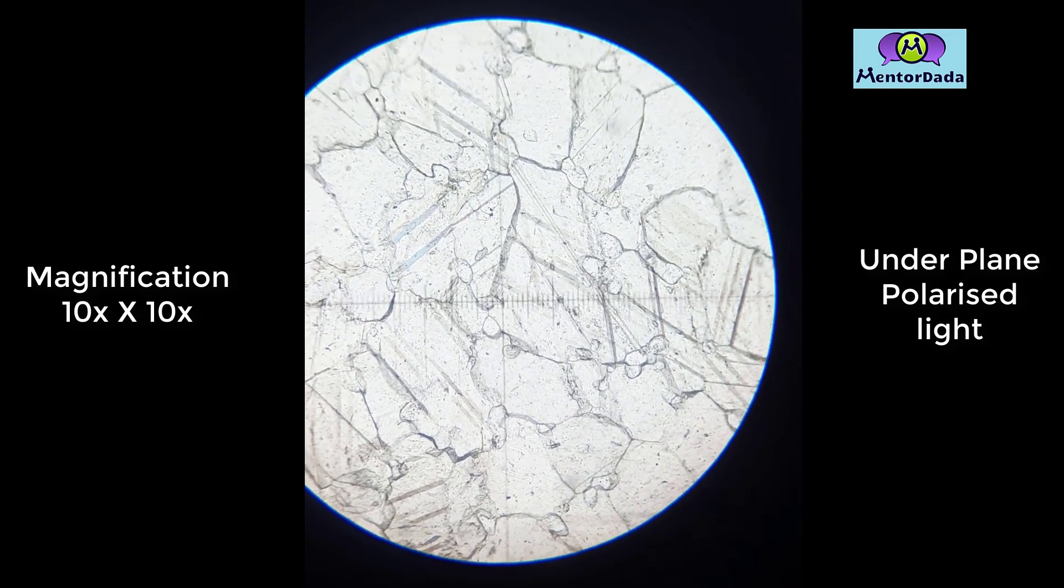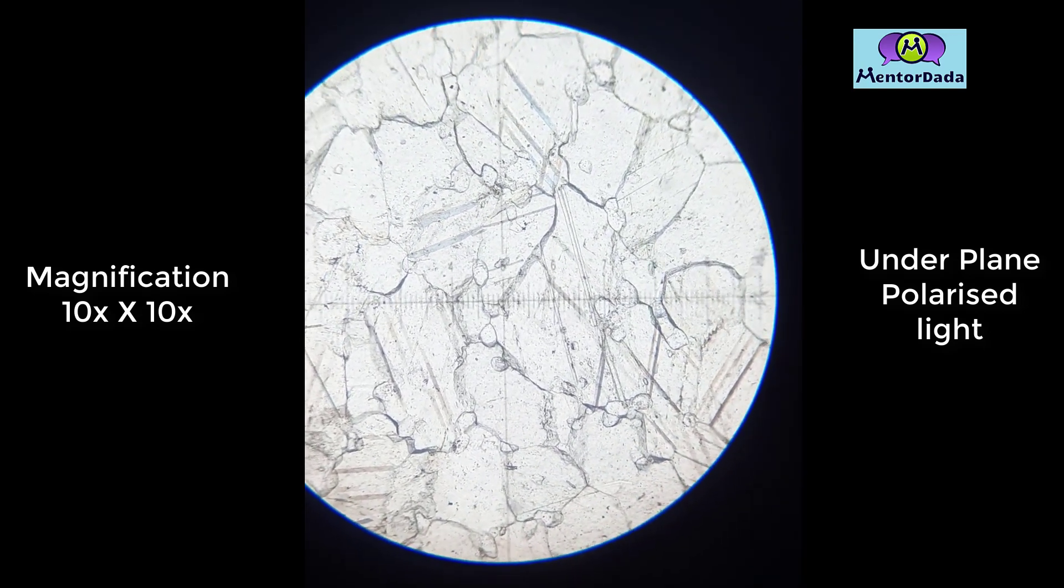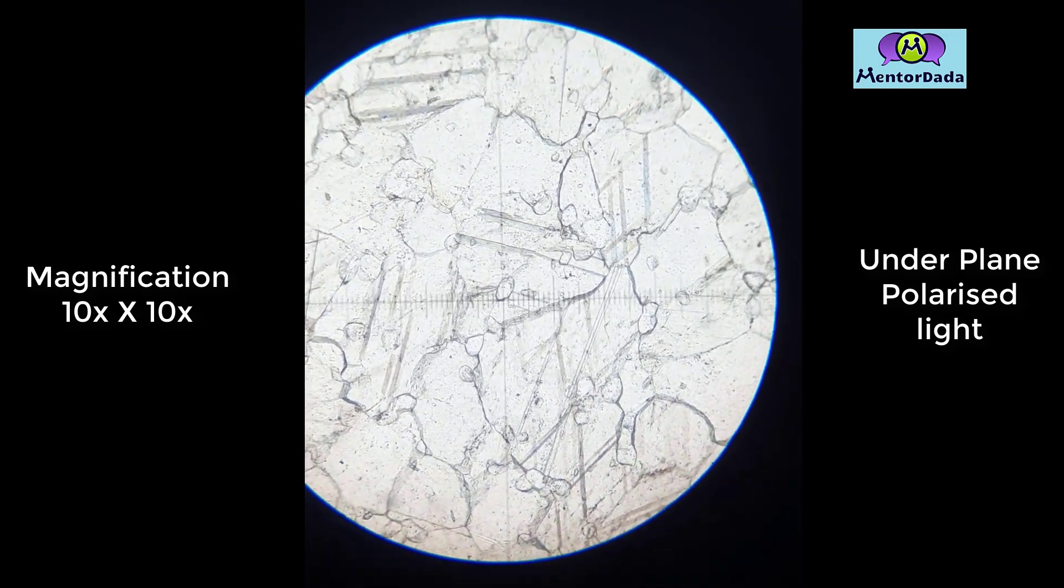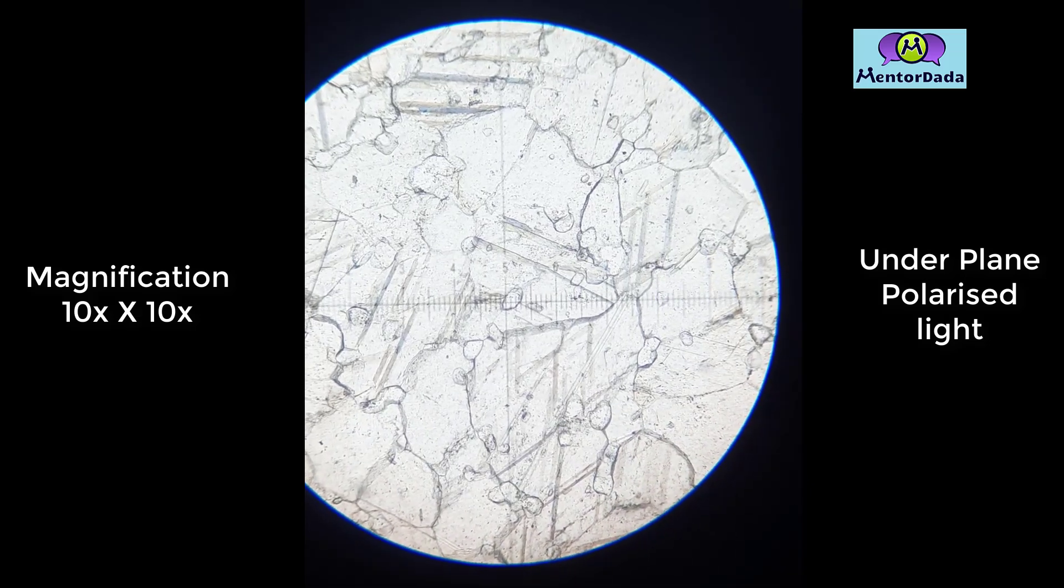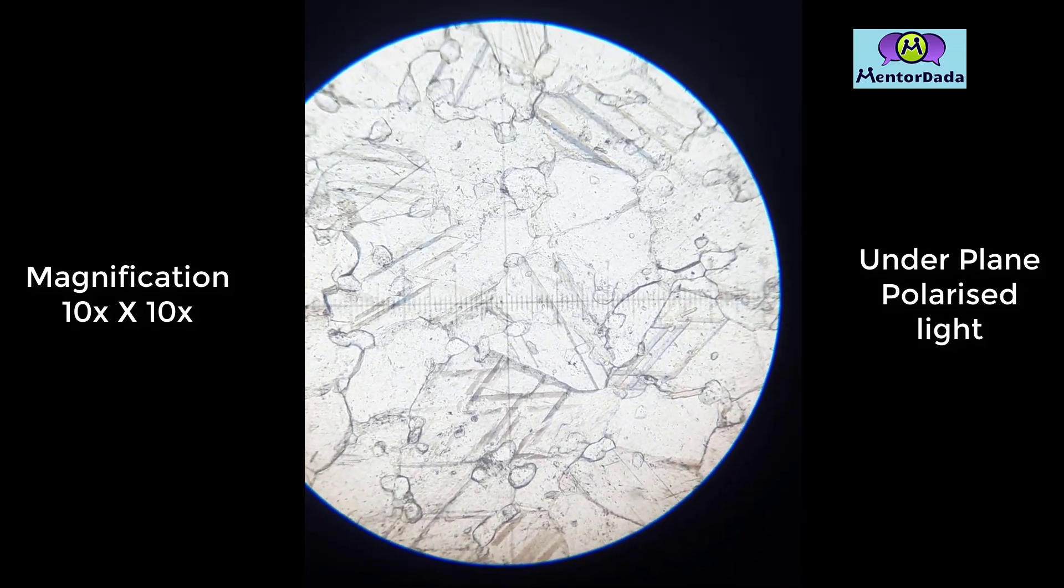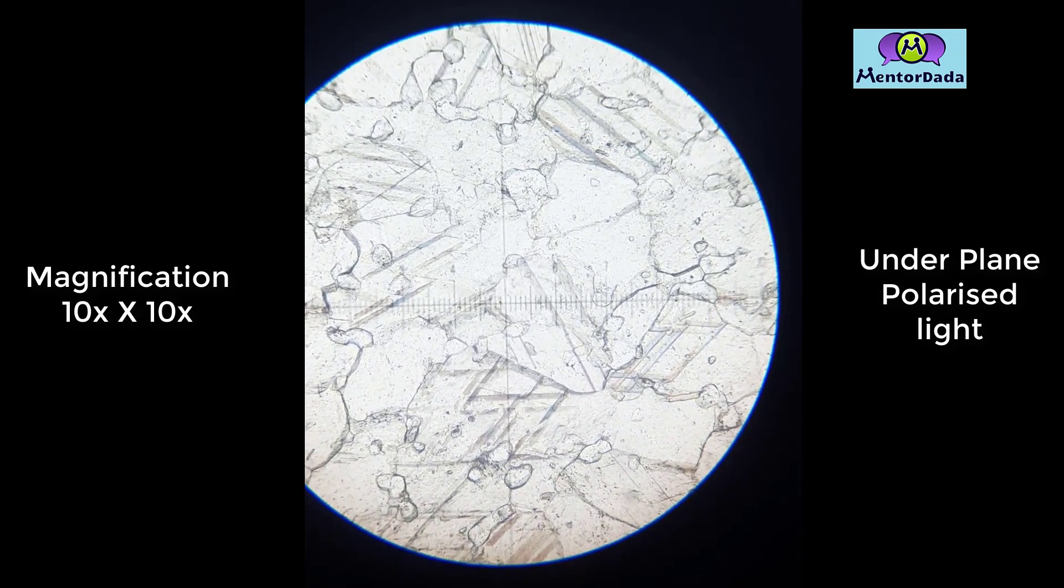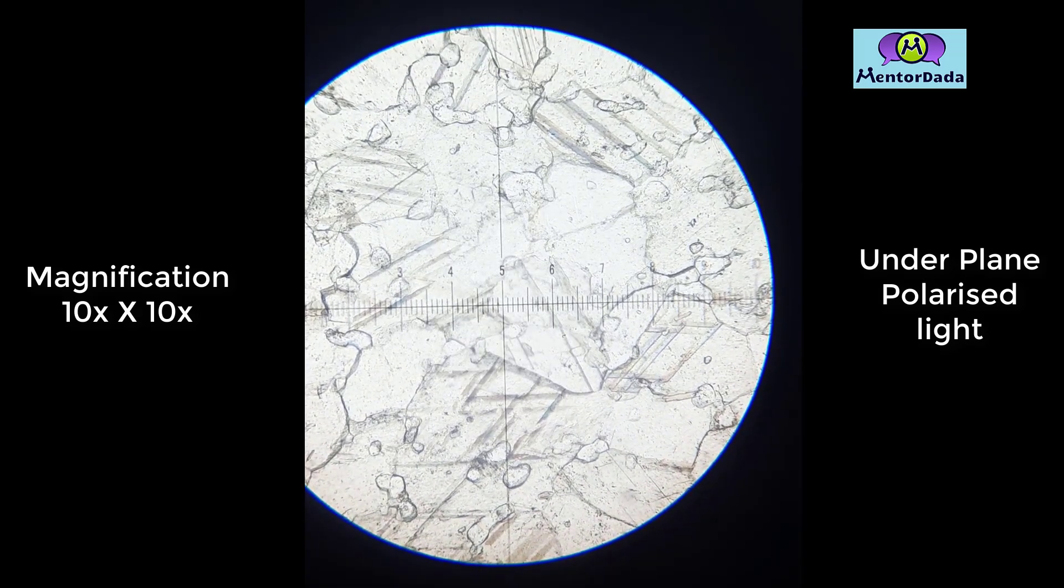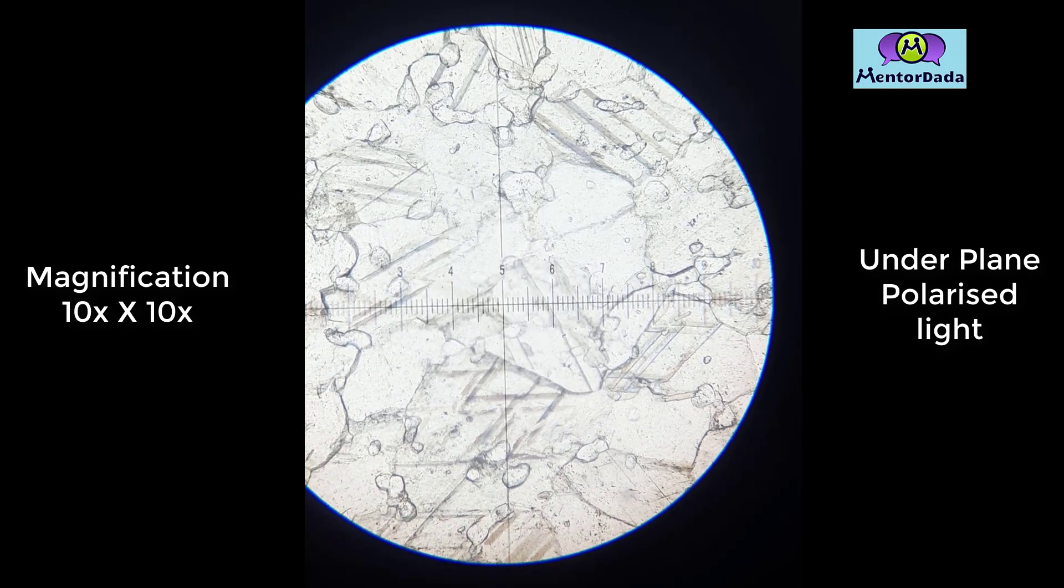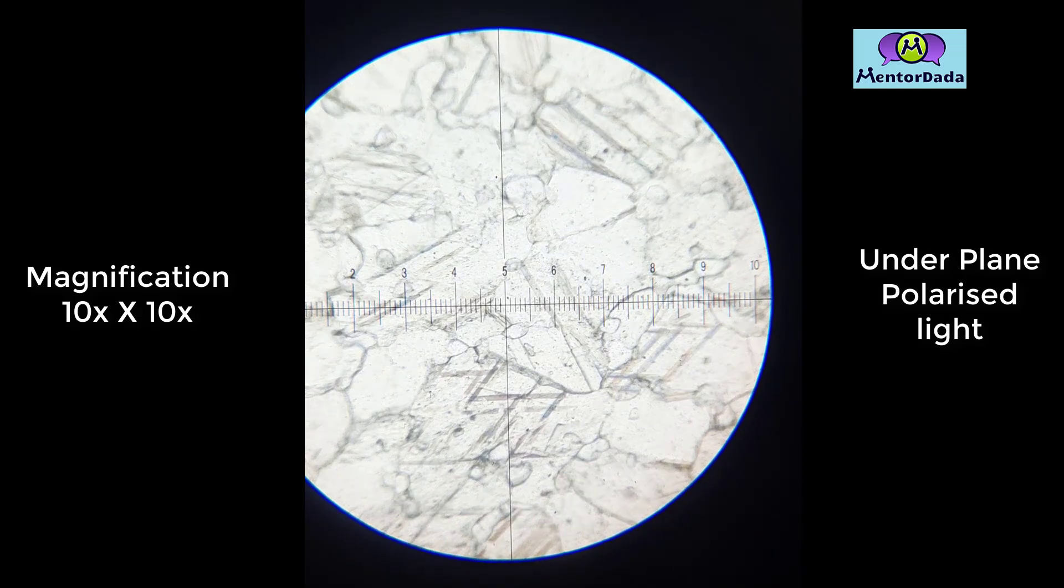Further, when we rotate the stage, the mineral changes refractive index from high RI to low RI. This change of RI is a significant property of this mineral, and this effect is called the twinkling effect. It is also a diagnostic property of this particular mineral.